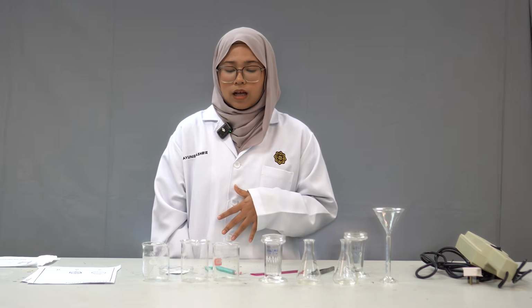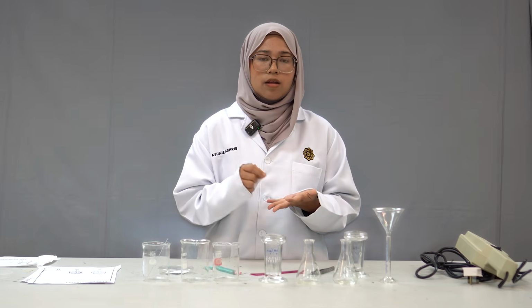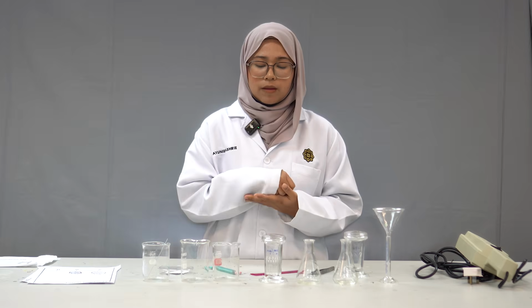And then when marking the baseline or solvent front, use a pencil, not a pen, because the ink from the pen can dissolve in the solvent. Okay, that's all for precaution steps for this experiment.